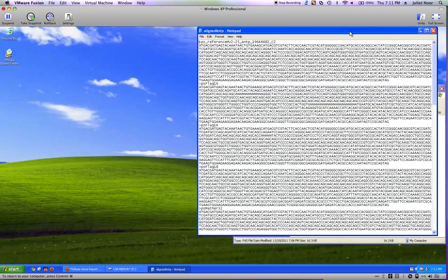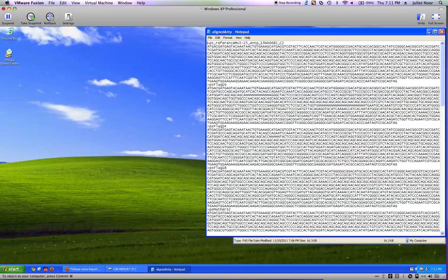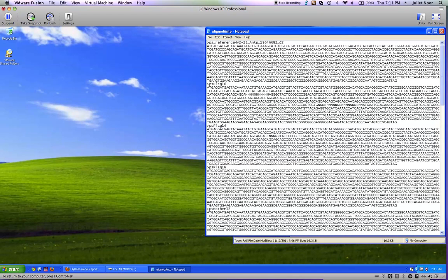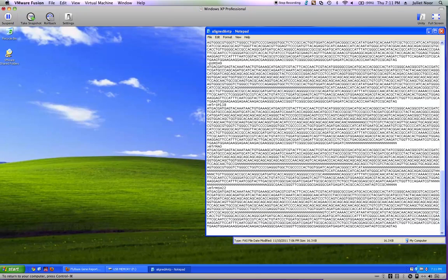It already has carriage returns between the strains, so it's easy to see the sequence for each strain. It's also easy to see that these are pseudo-obscura strains, and if I scroll down to the bottom, there are three Miranda strains.